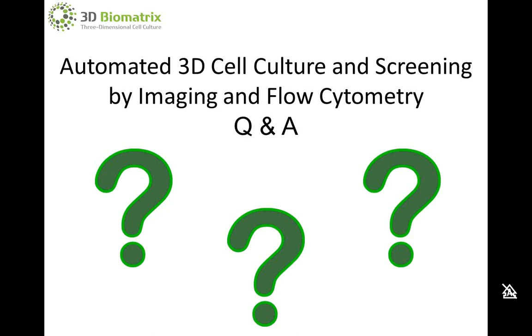And what we did find is that you would see what you would expect to see, essentially. So if you saw low staining on the imaging, you would get low staining on the flow cytometer. But essentially, that's still sort of asking the same question two different ways, as opposed to dissociating first and then staining, which, if you did have the spheroid preventing the stain from attaching to the interior cells, you would not necessarily detect that difference. So flow cytometry, doing exactly what was suggested, did confirm what you were seeing by imaging. You could quantify slightly better with the flow cytometer, but you wouldn't necessarily see the differences that were due to prohibitory staining in the spheroids.